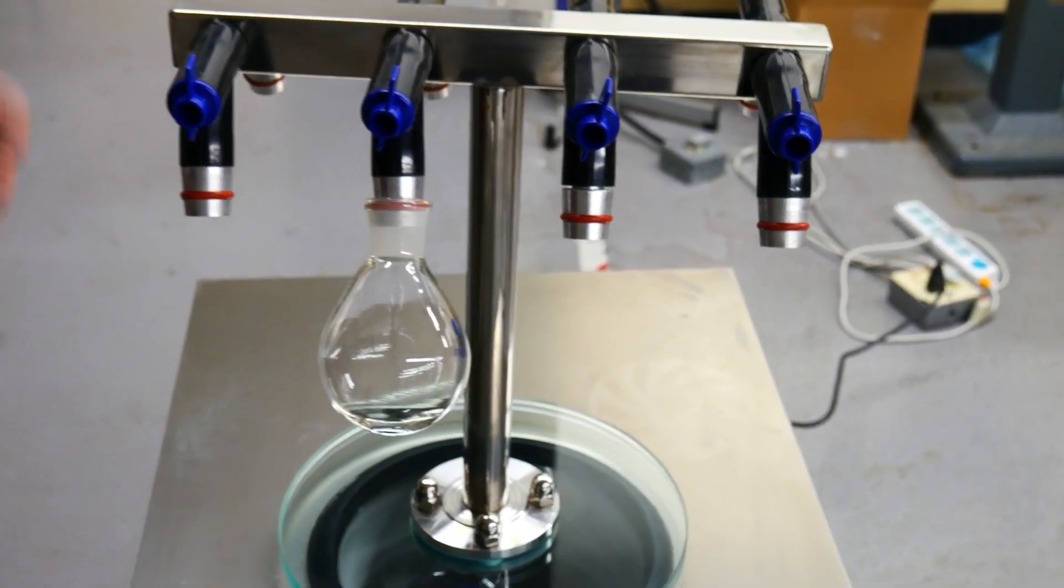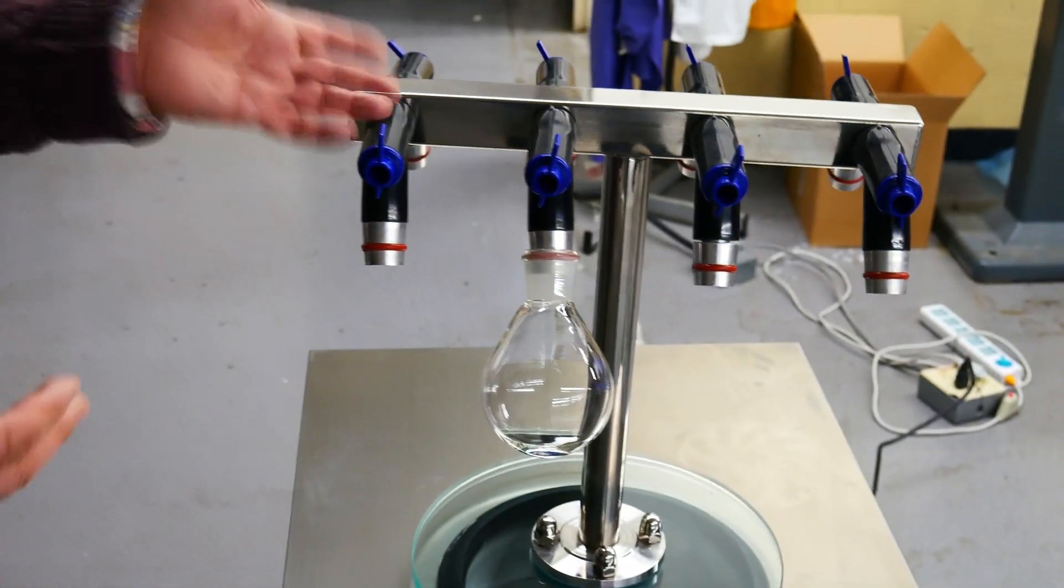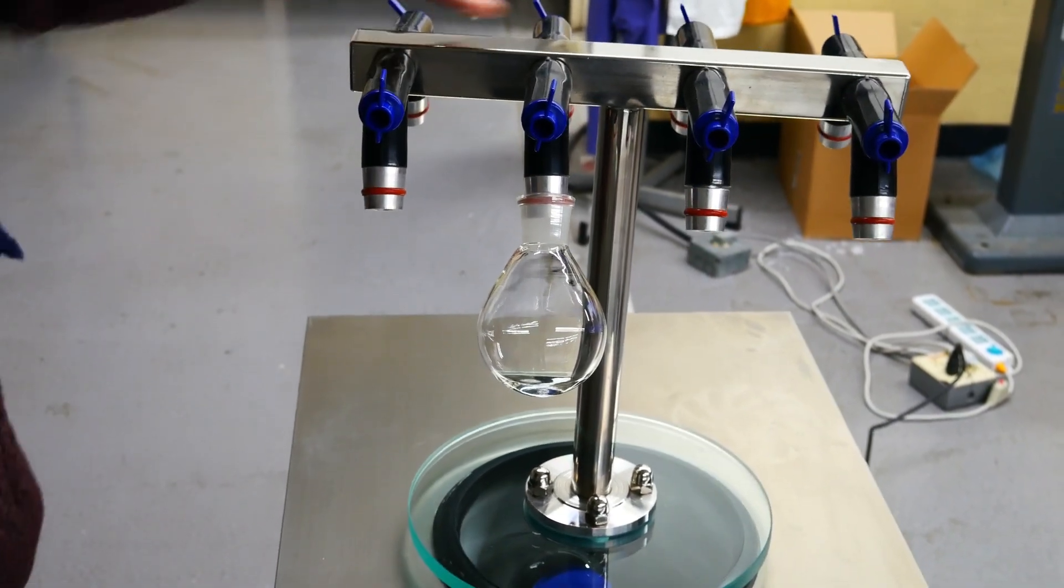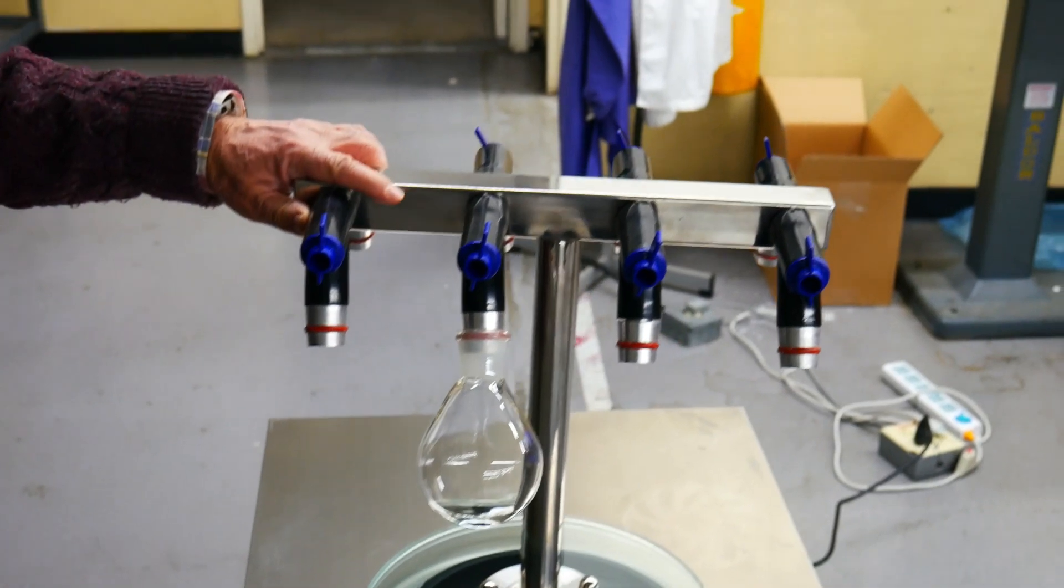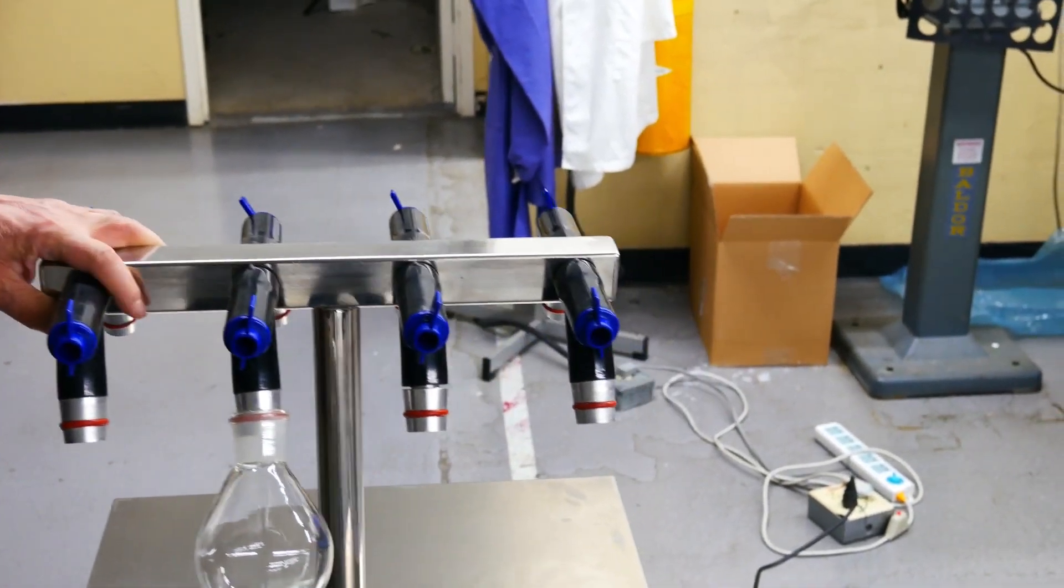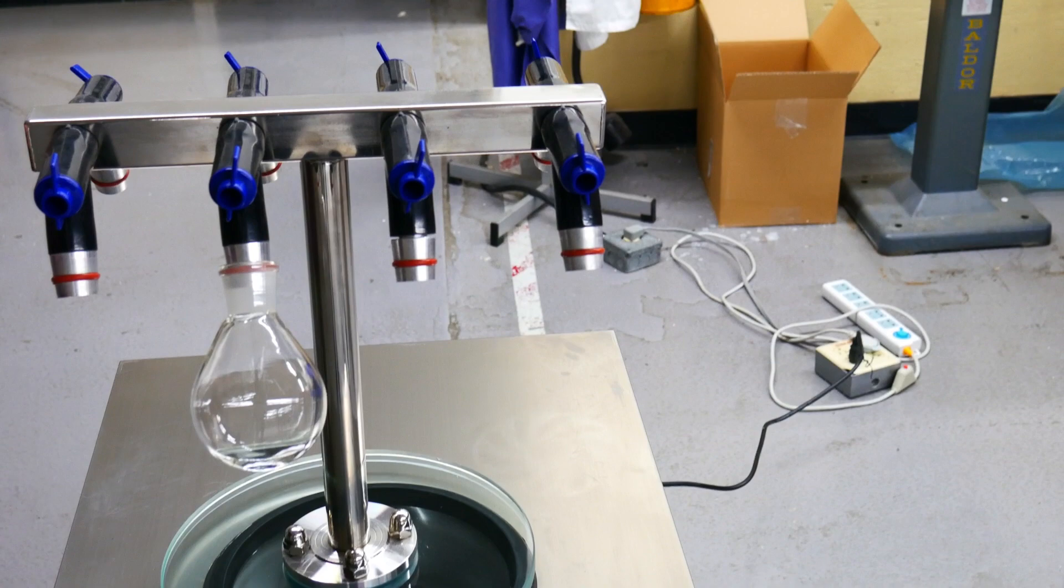In here, you have 8 ports or 10 ports, which is another great feature of the SharpFreeze system. So, you can have a chamber, which we showed earlier, and you can also have a tree with 8 or 10 ports to use.